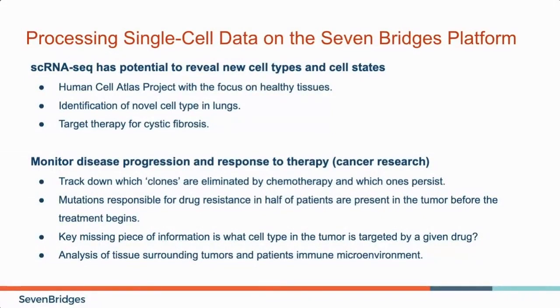So all of these and many other questions can be answered using single-cell transcriptomics in combination with bioinformatic tools we presented today, and cloud-oriented infrastructures like Seven Bridges Platform could help manage increasing sizes of single-cell data sets and provide the environment to conduct reproducible bioinformatic analysis.